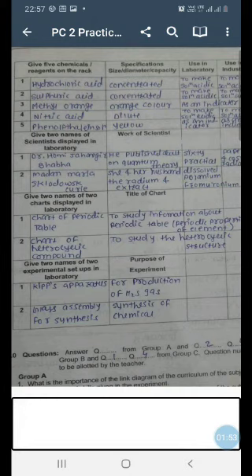which we are generally using for the preparation of distilled water, but actually that setup can be used for synthesis of various drugs, but its size is far bigger, so we are not practically using it for the synthesis. We will be using a small similar setup for preparation of certain drugs or chemicals.